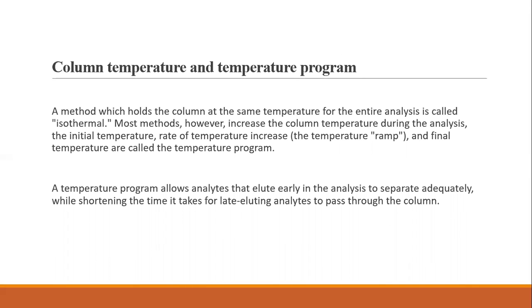The choice of column depends on the sample basically and the analyte measured. The main chemical attribute regarded when choosing a column is the polarity of the mixture, but functional groups can play an important role in column selection. The polarity of the sample must closely match the polarity of the column stationary phase to increase resolution and separation while reducing runtime. The separation and runtime also depend on the film thickness of the stationary phase, the column diameter, and the column length.